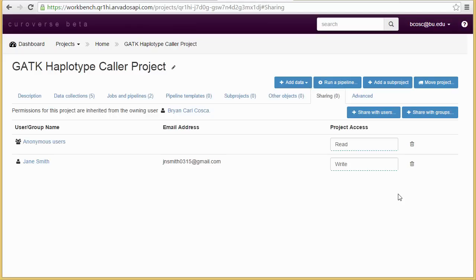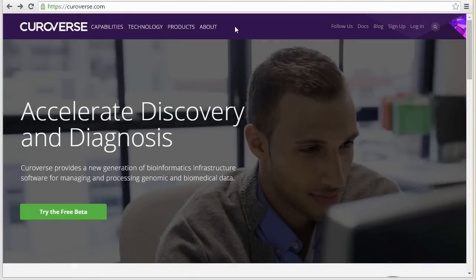All right, we're done. Not including the processing time, that took less than 10 minutes of work. As you saw, I was able to tackle all of the challenges I faced doing this haplotype caller work quickly and easily using Arvados. Our goal is to streamline your work and make you more productive.